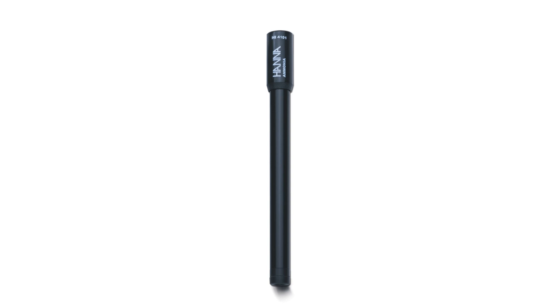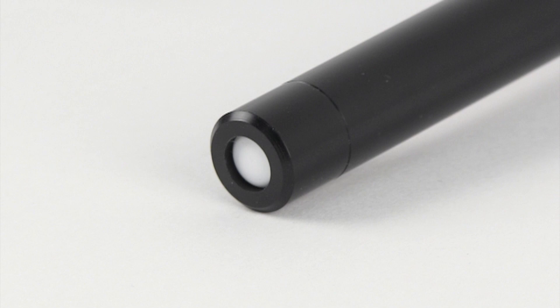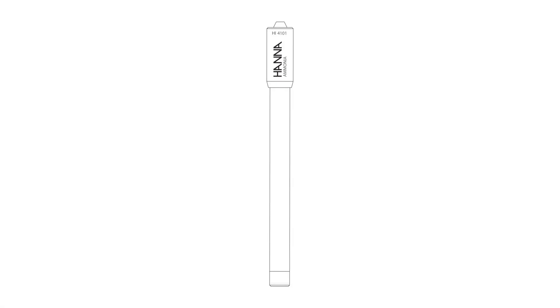The HI4101 ammonia ISC is a gas-sensing electrode. Ammonia gas diffuses through a selective PTFE membrane and changes the pH of a thin layer of electrolyte between the membrane and internal pH sensor. This change in pH corresponds to the ammonia concentration in the sample.